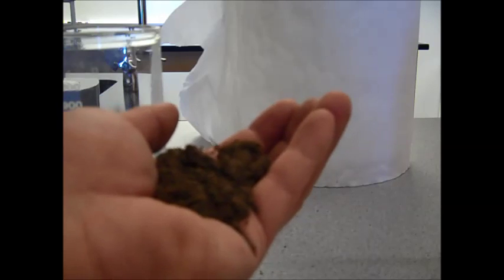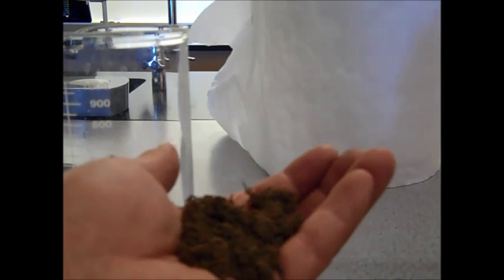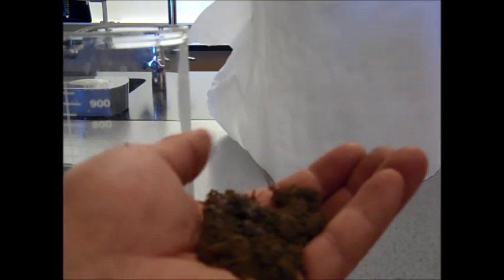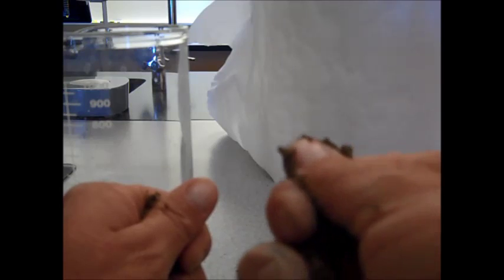Lastly, you're doing feel or field classifying. In this method, you take a soil in your hand, you add water. I have a fancy little squeeze bottle that I'm adding here, but in this case, I'm excessively wetting a small pinch in my hand, and I'm feeling for 3 things: coarseness, which would be sand, stickiness, which would be clay, or slickness, which would be silt. And so I'm feeling for that. This is a very low-tech method of getting your hands in the dirt.